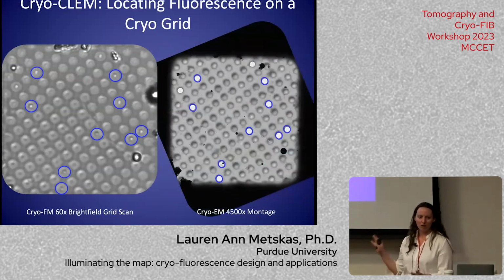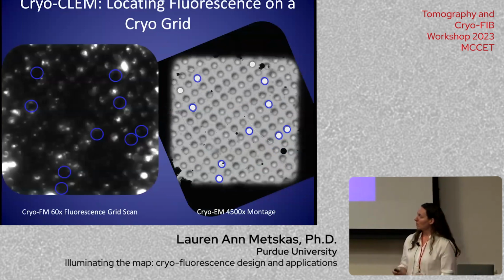And this alone will already get you within about 300 nanometers of your target. For us, most of the time, our field of view is 1 micron, even at high res. So this is enough, and this is really all the correlation that we do at the microscope. So it's very fast. Once we've got this correlated, we can drop in a different color channel. In this case, I've registered my fluorescence with my transmitted light, and so now these two are in the same registration. So you can just point to any one of these dots and be taken there on the TEM stage.